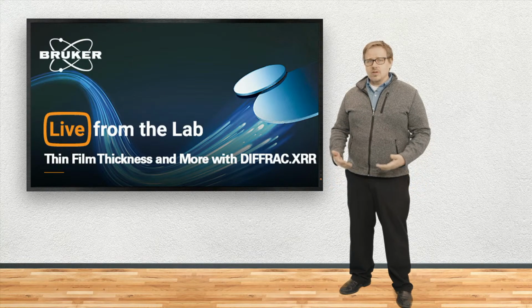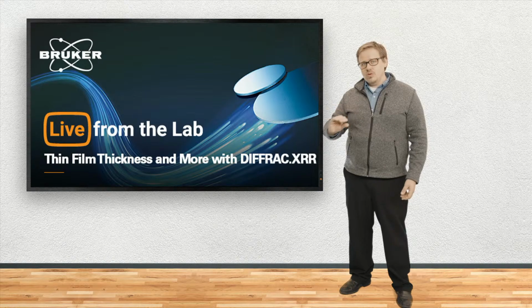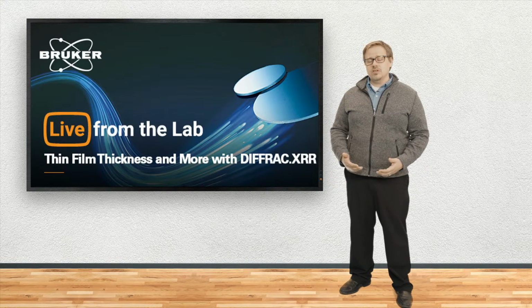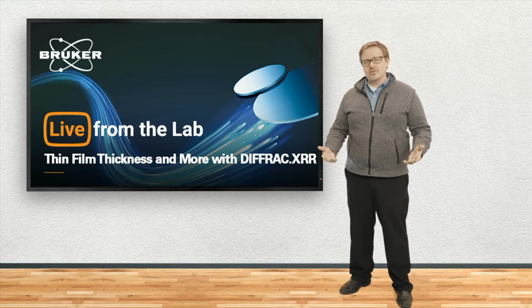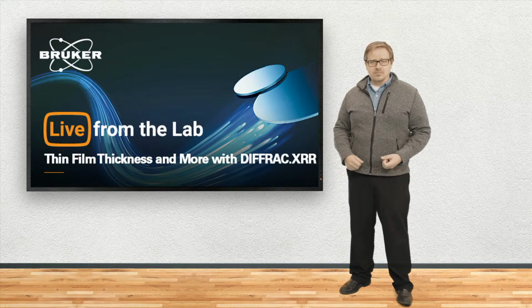Now, modern thin films are even approaching smaller and smaller thicknesses. We're getting to the point where films can actually be just a few atomic layers thin. And in that case, what we find is that these materials do some pretty amazing things. In fact, this lays the basis for modern sensors that we find in all kinds of devices, such as our cell phones or video games or our TVs.